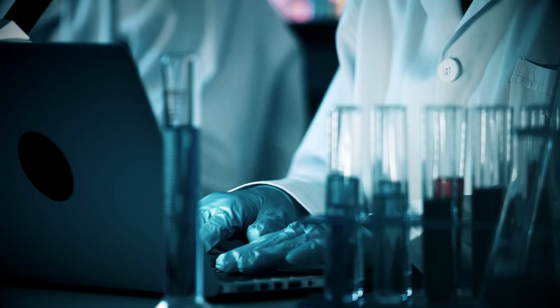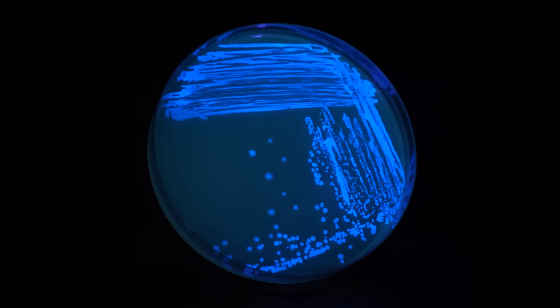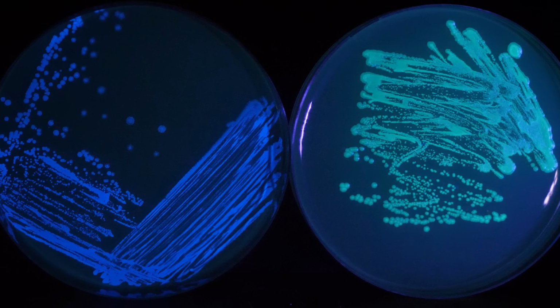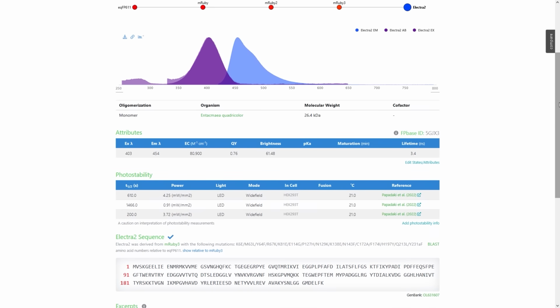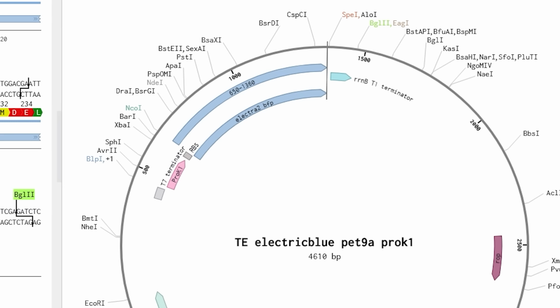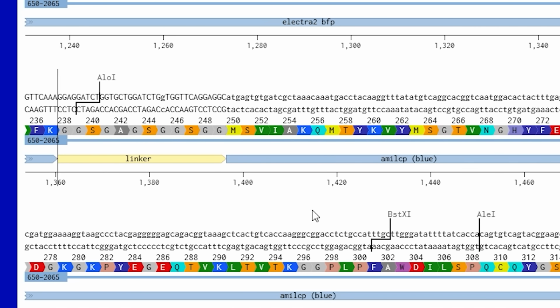But, I mean, I'm a genetic engineer and I can print whatever I want, so I made this. I call it electric blue, and you'll see that it is both blue in white light and under UV. And the glow color really is a deep ultramarine blue, not the usual cyan of many other fluorescent proteins. To design this, all it really took was a little bit of copy and paste. I looked up the code for AmilCP, and I found the code for a bright blue glowing protein on FPbase called Electra. Then, instead of just pasting them side by side in the plasmid, I added a little flexible linker sequence between them. I also removed the stop codon from Electra to make sure that the ribosome reads through and makes this as one giant protein.